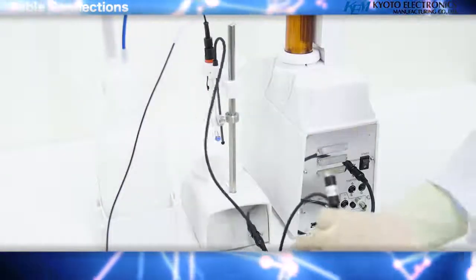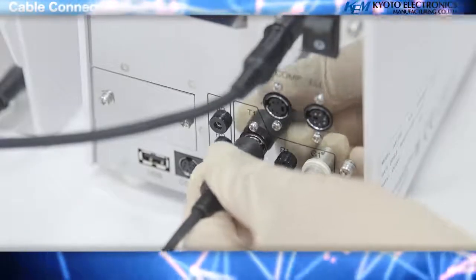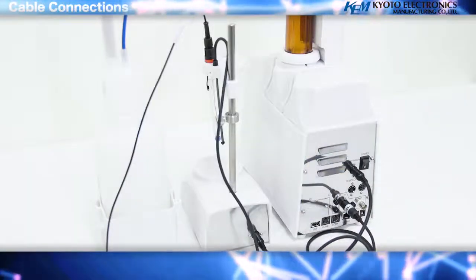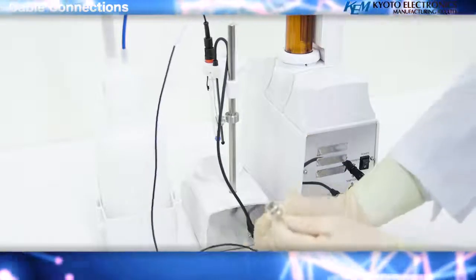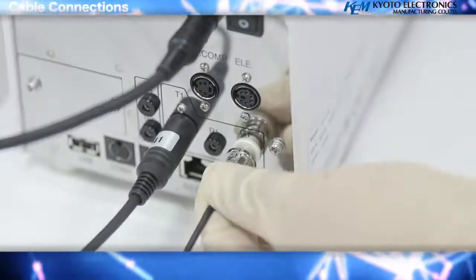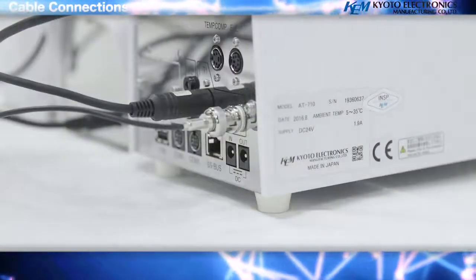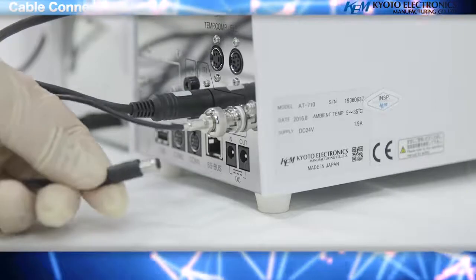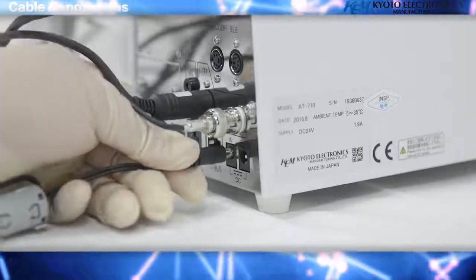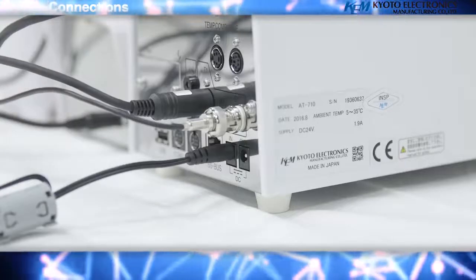Connect the electrode lead to the pre-amplifier on the back of the main unit. After inserting the connector, turn it around to lock it into the G1 terminal. Attach the power cord to the AC adapter and connect the connector plug of the AC adapter to the in-power connector slot on the back of the main unit.